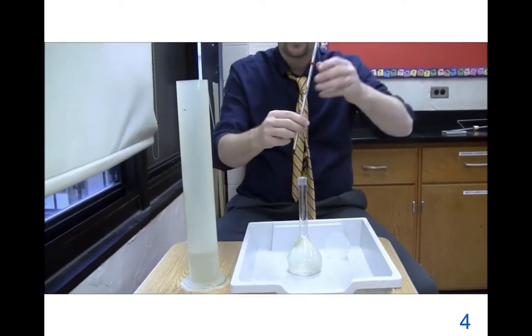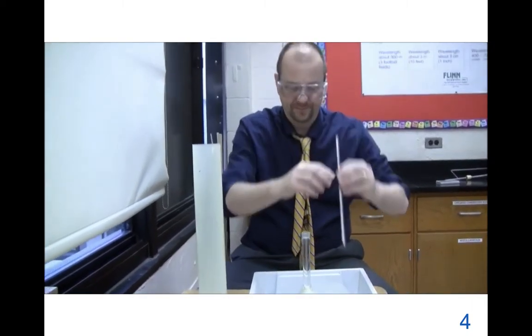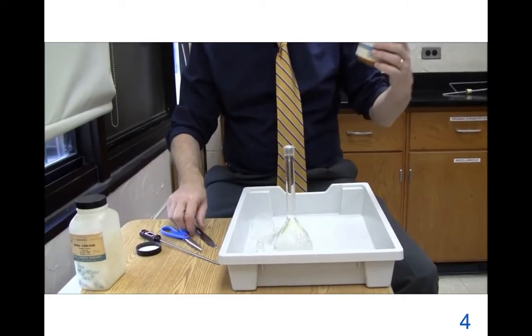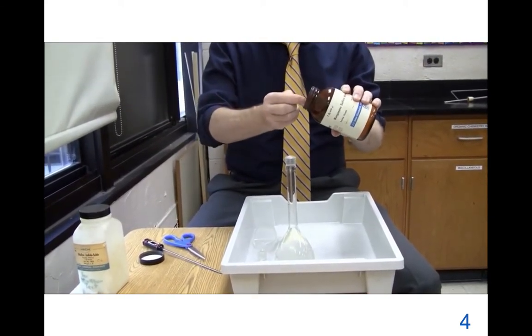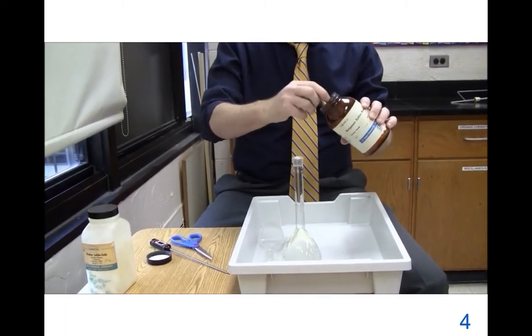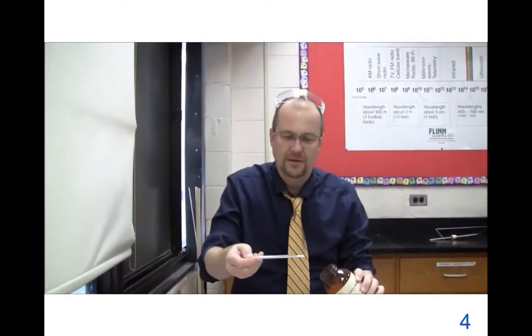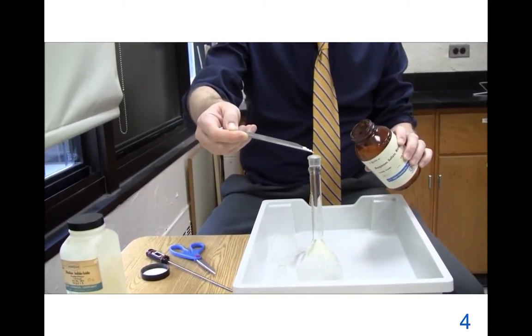Let me take the temperature. A chilly 8 degrees. Okay, now I've knocked a bit of the water out. Okay, grab some manganese sulfate monohydrate. This supplies the manganese 2 ions. I've worked out you don't need much. Oh, you need some though. There we go, smashing. About that much. You put that in.